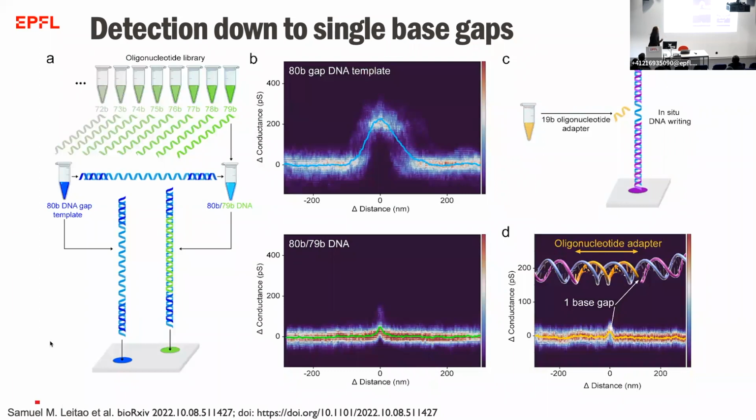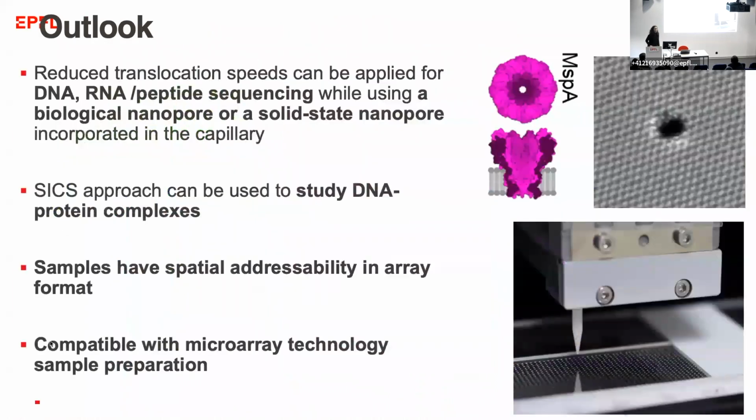And now, looking at the possibility to observe this single base gap in a DNA, by an operation where we can rescan the same molecule many times, and working with the small capillaries and with very talented students, these results can be obtained. What we would like to do further, as the resolution of any microscope, but this one as well, depends on the probes.